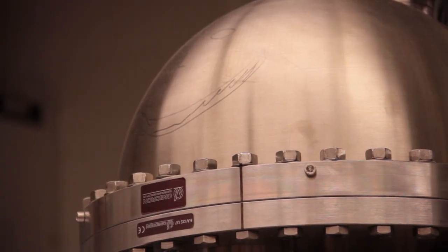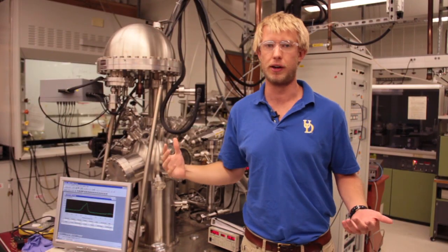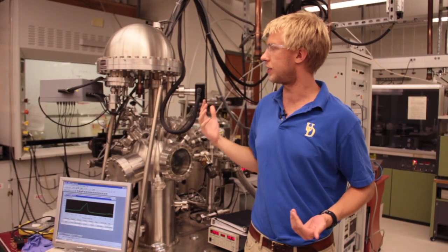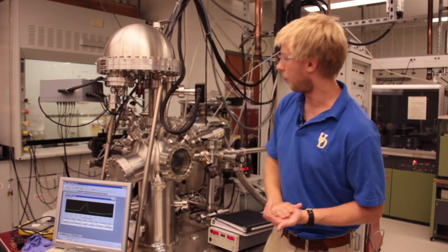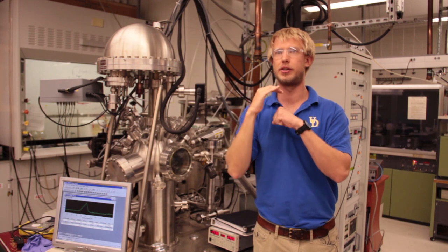The electrons get curved around here by an electric field. Based on how much they curve we can tell how fast they're going, and how fast they're going tells us their energy. Their energy tells us how strongly they were bonded to that center nucleus.